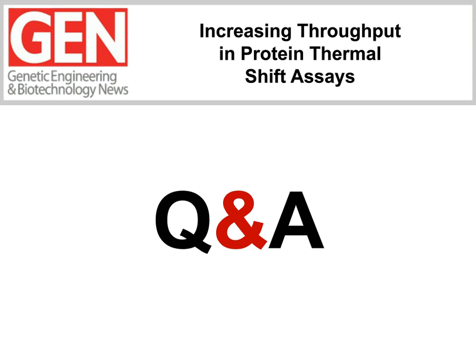All right, interesting question here. It says, what are the biggest causes of false positive hits in protein thermal shift assays? The variables are many here, in the sense that you cannot say this would be the reason for the false positive hits. Let me put it this way. A biological truth can be a truth only if more than one analytical event has been confirmed independently. What I mean is you need another set of experimentation A and another set of experimentation B, and both should be confirming the same thing. And then only it becomes a biological truth, and it could be a biological event.